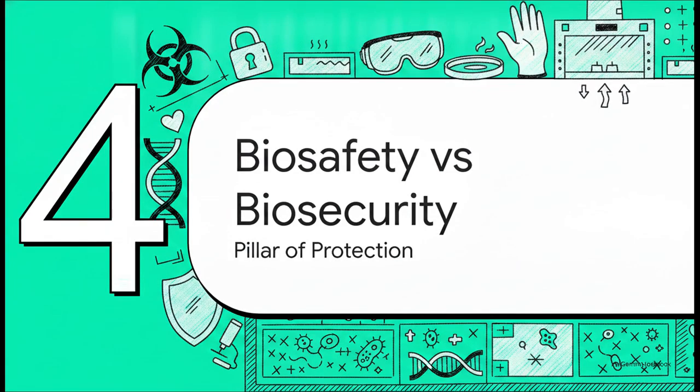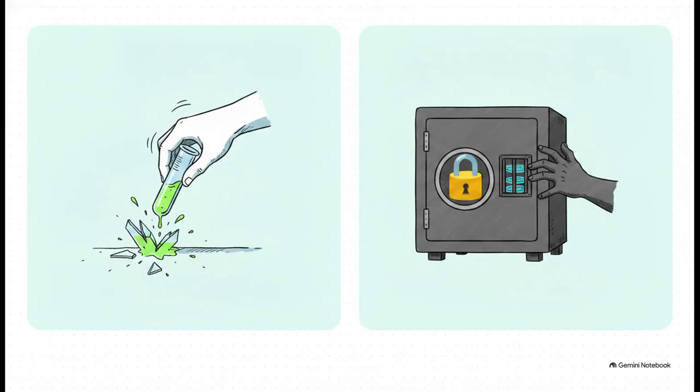All right, that covers the precision side of our explainer. Let's shift gears to Section 4, biosafety versus biosecurity, the pillar of protection. We're going to look at how the lab keeps its personnel and the public safe from the hazards inside. Now, these are two terms that sound practically identical, but they are fundamentally different beasts. The easiest memory trick here, it's all about intent.